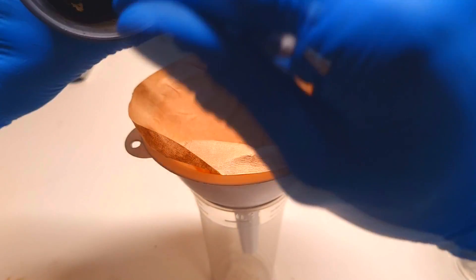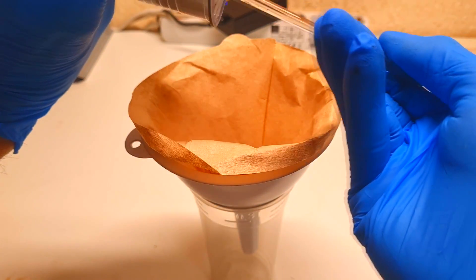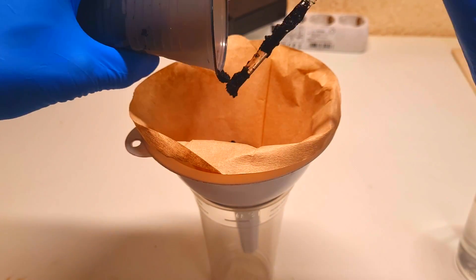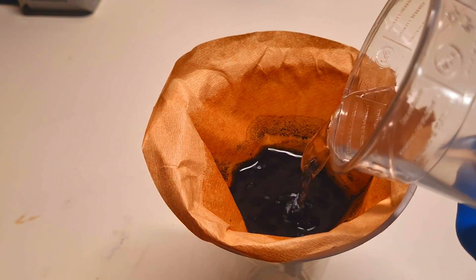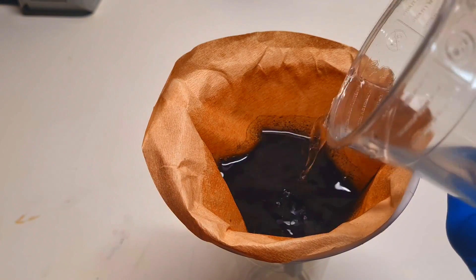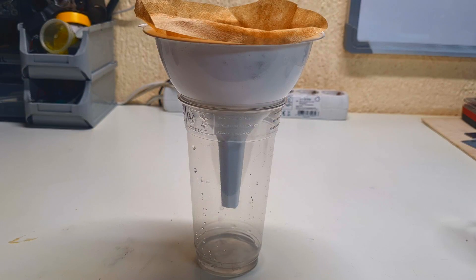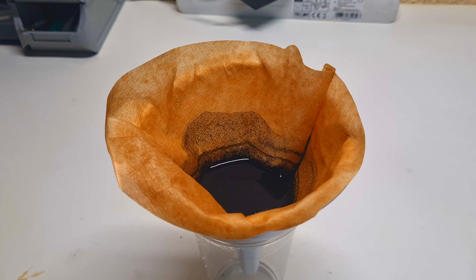Here I have my funnel with filter paper inside, filled with some material. But now I want to make filtration a little bit faster, so I'll make myself a vacuum filtration funnel.